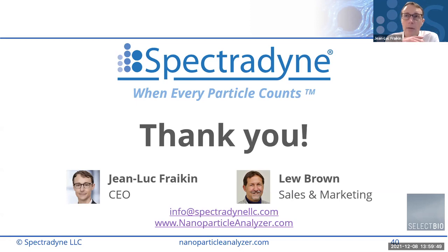So hopefully that answers your first question. Second question, the sample prep requirements are essentially to make sure the concentration is in a measurable range. The dilution of the sample needs to be such that you're not counting too many particles, so that the particle events aren't overlapping in time, and not so low that you have to wait forever to count a significant number of particles. That's how we determine the range of concentrations for each of our cartridge sizes.